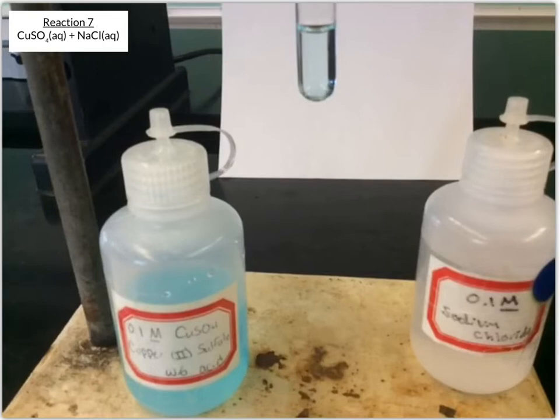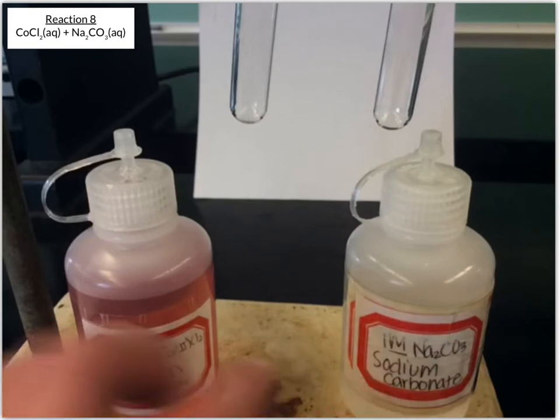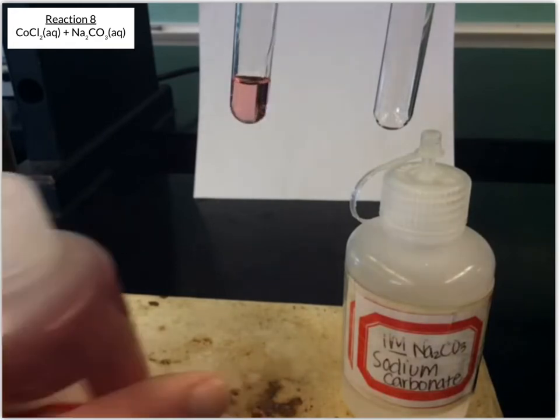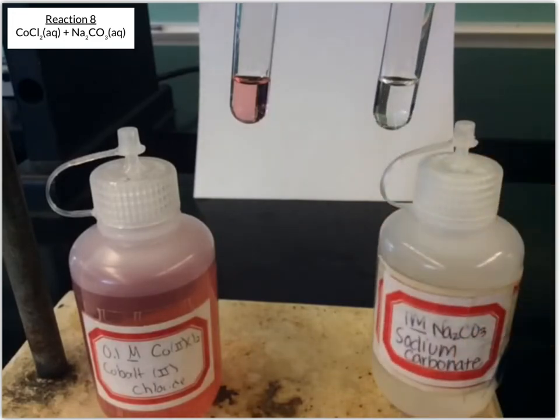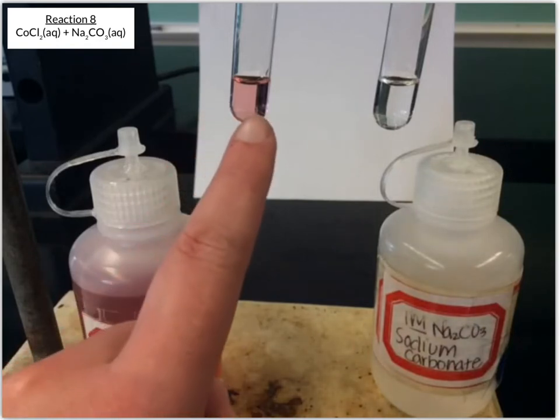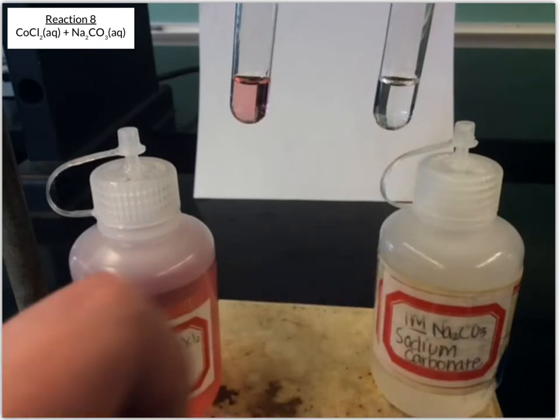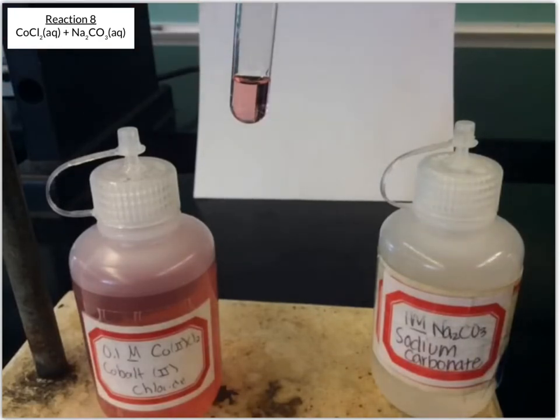Okay, reaction number 8, we're going to react cobalt 2 chloride with sodium carbonate. Okay, and the cobalt 2 chloride that we're starting with is a clear pink solution. The sodium carbonate is a clear colorless solution. So we'll take this sodium carbonate solution and pour that into the cobalt 2 chloride.